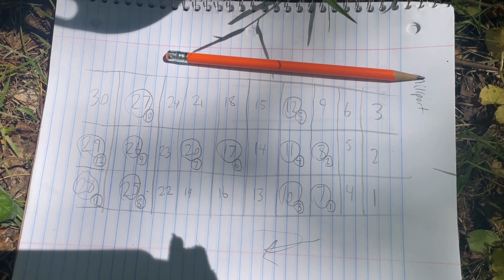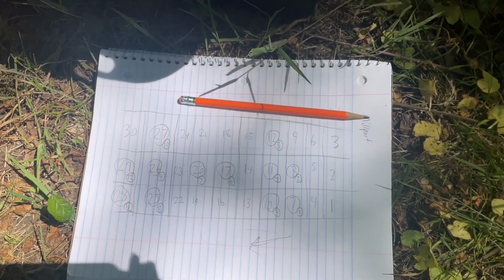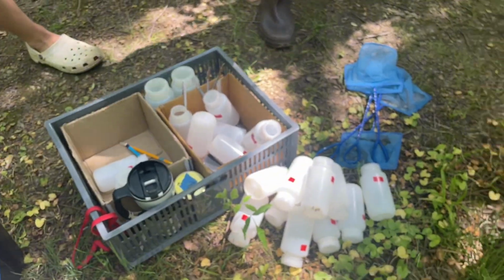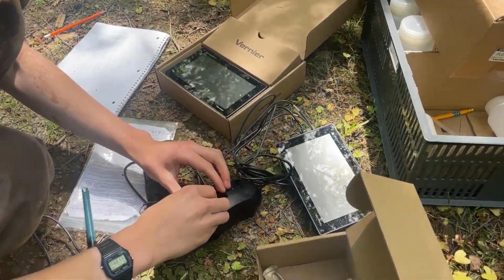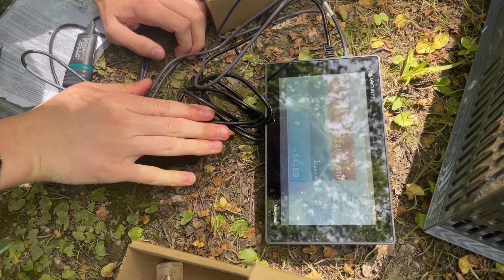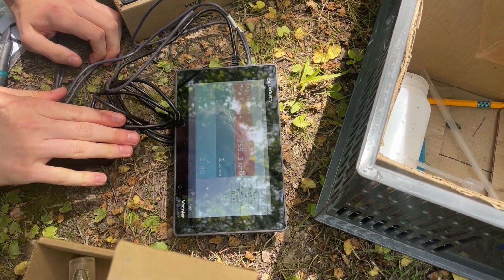We have made some changes since the field guide was written. The previous Watershed class followed a river chart with 21 possible testing locations per water stream, where 12 of those spots were randomly selected to test. This year, we used 30 possible spots and tested 12 of those, which allowed for more random locations to be tested. The nitrate sampling is vastly more efficient than in previous years due to the new Vernier probe.